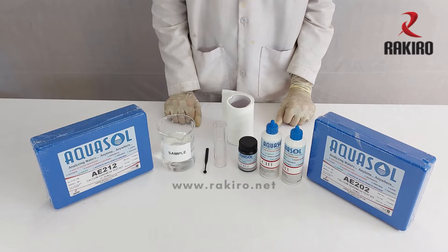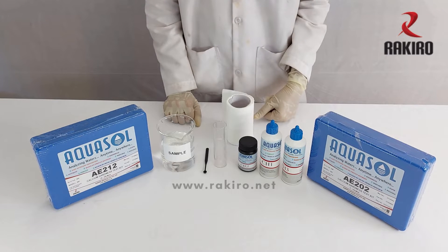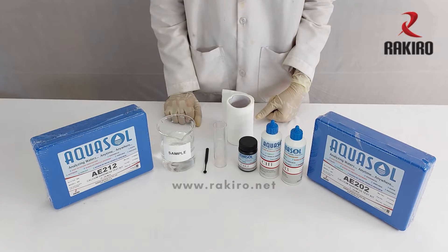We are demonstrating the calcium hardness test kit — Aquasol AE202. It is used to check the calcium hardness of water.